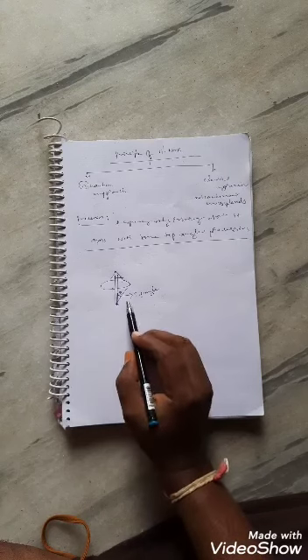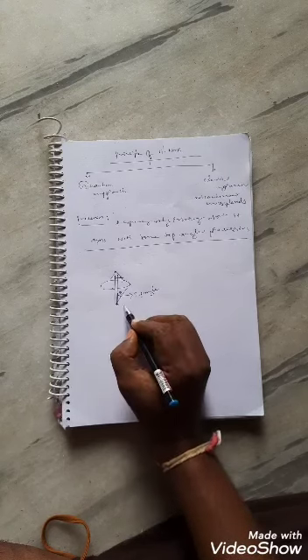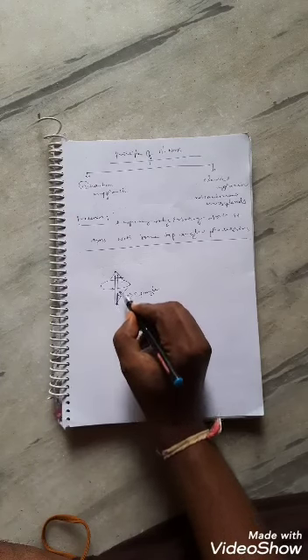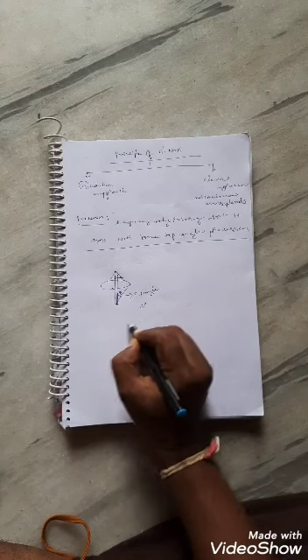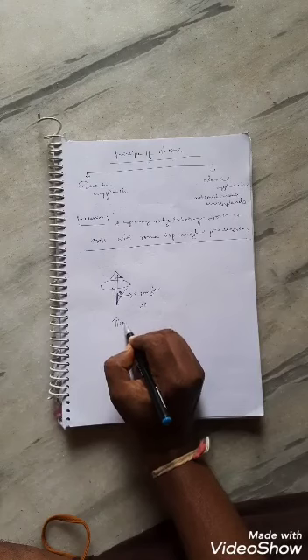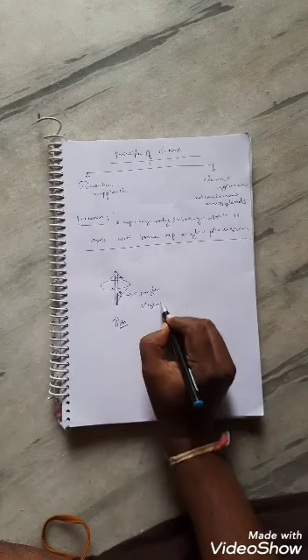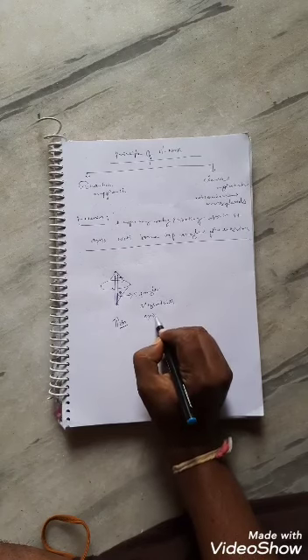And the direction of this magnet is aligned with the external magnetic field.